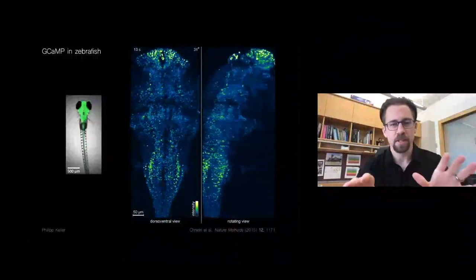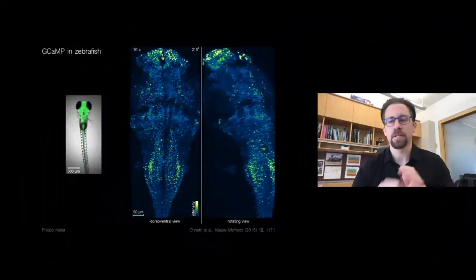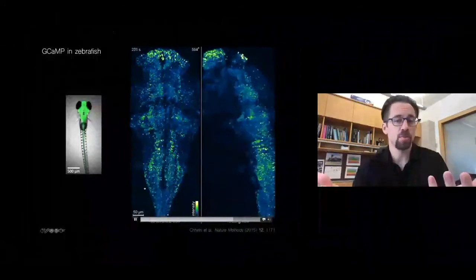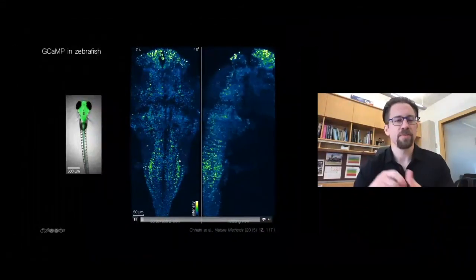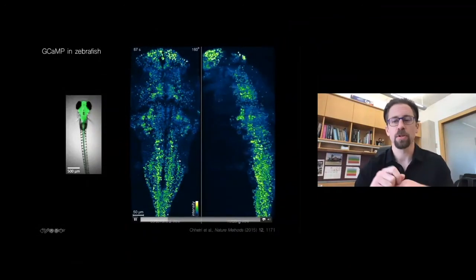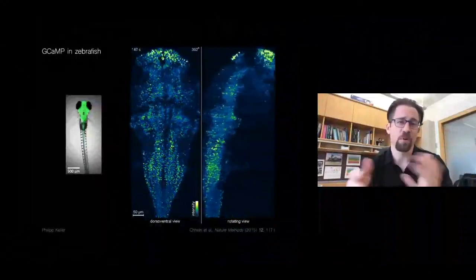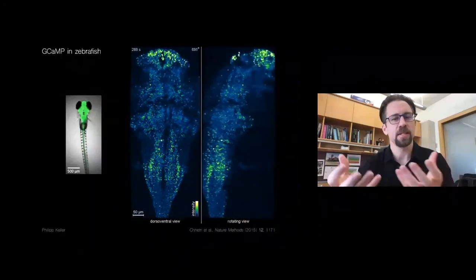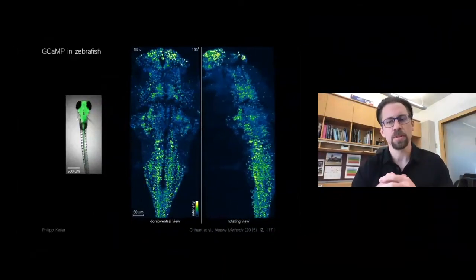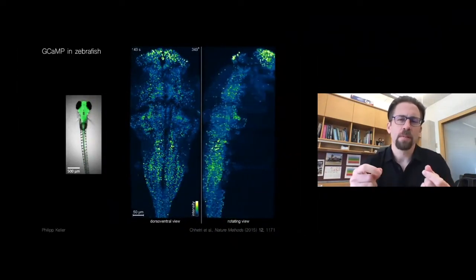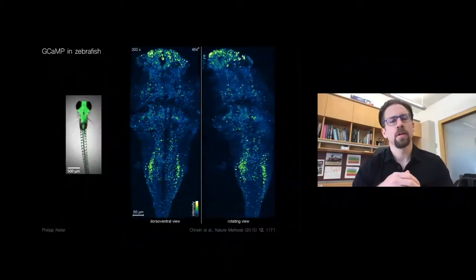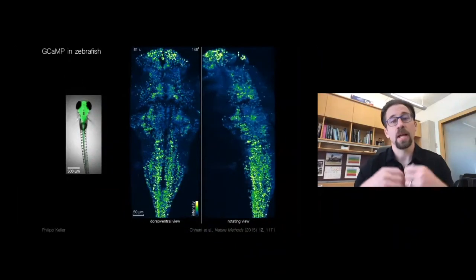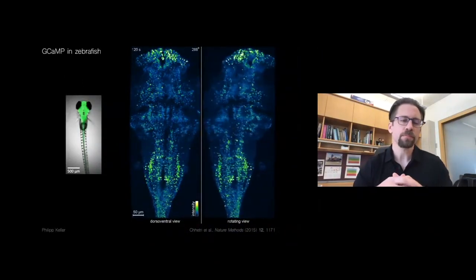So here's one more example of GCaMP imaging. This is a larval zebrafish with GCaMP in all of its neurons, being imaged on an incredible light sheet microscope called the IsoView that was developed here at Janelia by Philipp Keller's lab. So here you can see basically all of the fish's hundred thousand neurons in action. These large pulses of activity that you see in the back part of the fish's brain called the hindbrain occur when the fish is swimming, or at least when it thinks it's swimming. This fish has actually been paralyzed so that it stays under the microscope because fish are actually quite fast and they're too small to carry the microscope around with them. So labs like Misha Ahrens's lab at Janelia have set up a virtual reality system for the fish, kind of like we saw for the mouse earlier, to study certain behaviors.